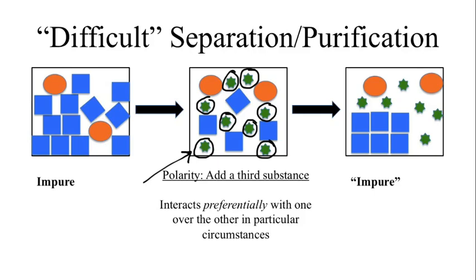So our ability to get product out of a solvent is really dependent on how much solvent we use. If I use a lot of solvent, that solvent increases its likelihood of breaking apart those intermolecular forces and reducing my yield, sometimes to the point where I can't get any crystals back. So one of the trickiest parts of the recrystallization procedure is knowing how much solvent to use.